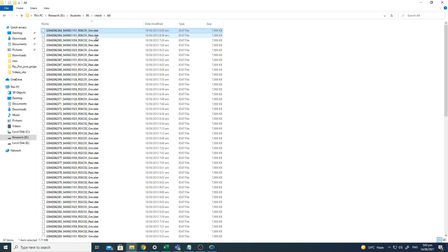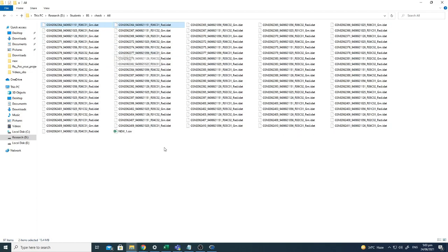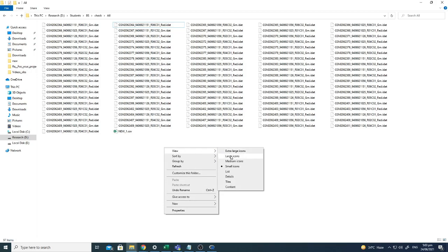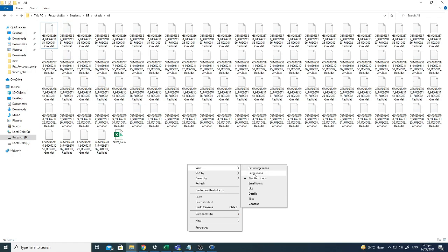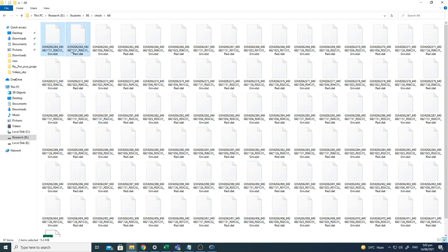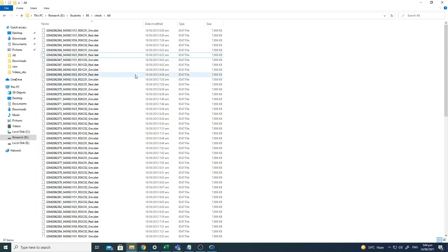two files represent one patient. For example, Grn.idat and Red.idat is one sample, and here you can see R06C01 is the first sample, R06C02 is the next sample, and so on and so forth, right? So here you can see all these data sets organized into pairs, right?